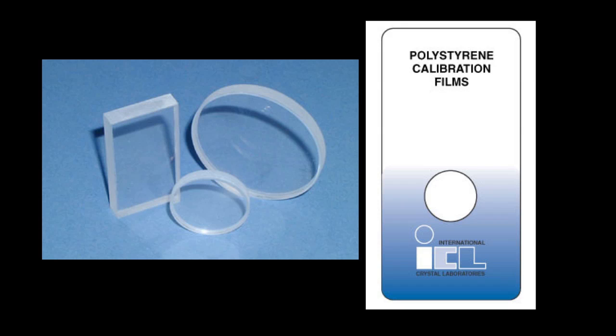Now another way we could do this experiment with liquids is we can use one of these polystyrene cards. This polystyrene card is a cardboard card but down here there is a little window and this window has a polystyrene film in the window. So again you place a drop of your sample onto the polystyrene film, you place this in a sample holder, you pass IR light through it, and because your sample is being suspended in the window, the IR light passing through it will be affected by covalent bonds in your molecule.